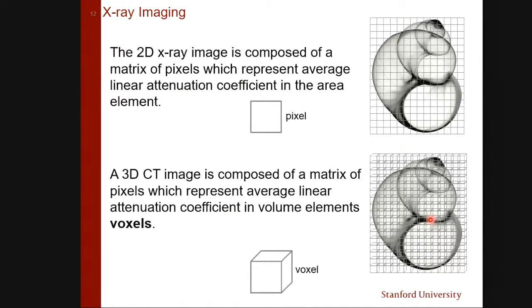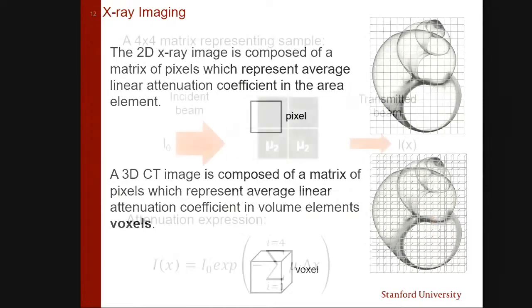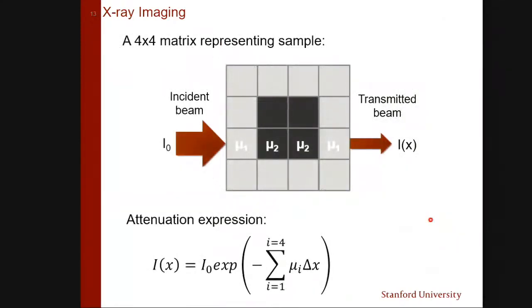So you have to understand this. If you want to image a 1 micron object, probably you would think, I need probably 3 voxels per object. That's a minimum. So it means your voxel size should be around 0.3 microns for this type of object to image. So how does this actually work?